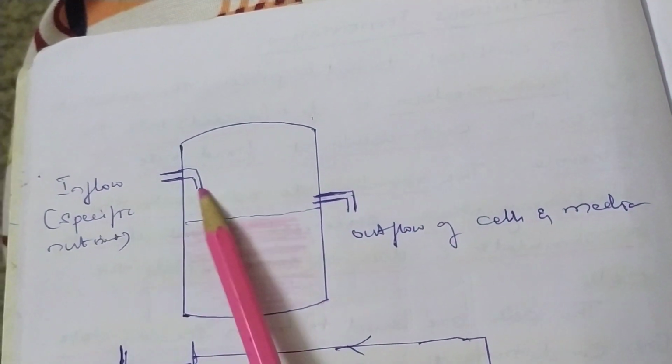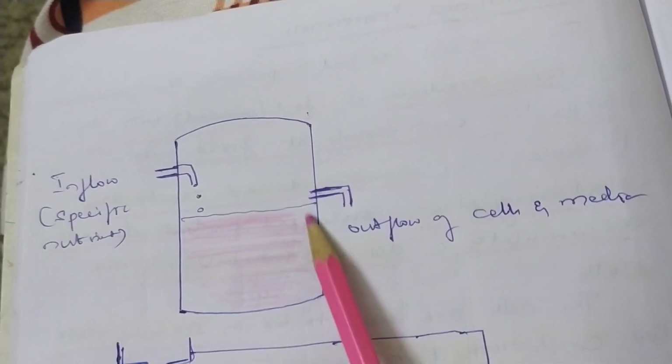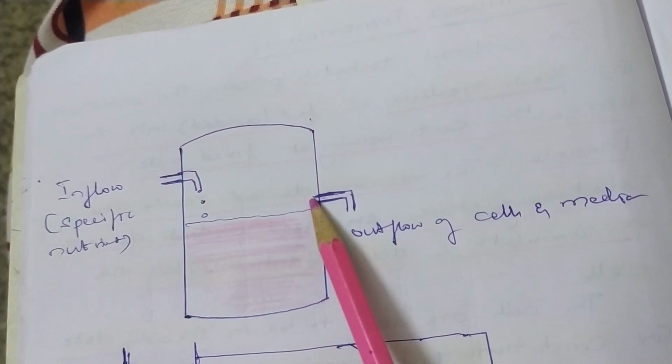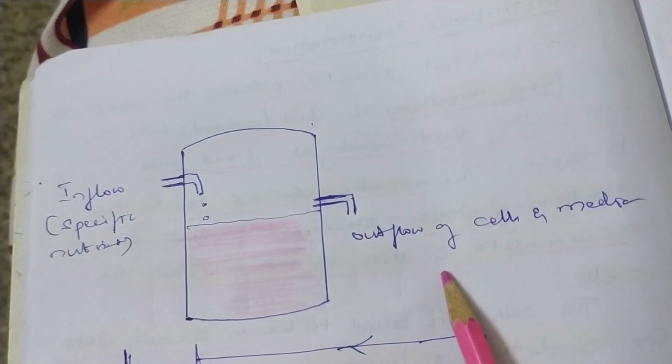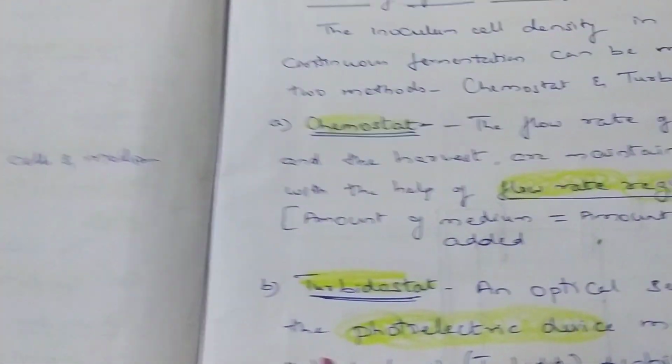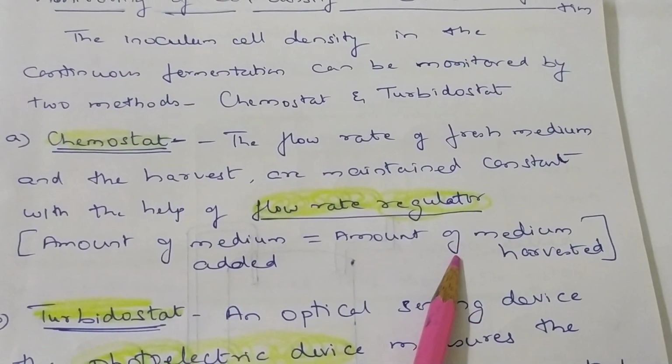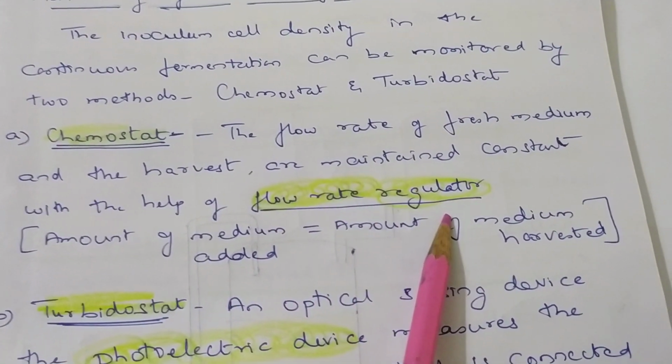You provide them nutrients, and meanwhile product will be produced. As the flow rate increases, whatever is here will be released and collected. To make you understand, the amount of medium added is equal to the amount of medium harvested. So this is called a flow rate regulator.